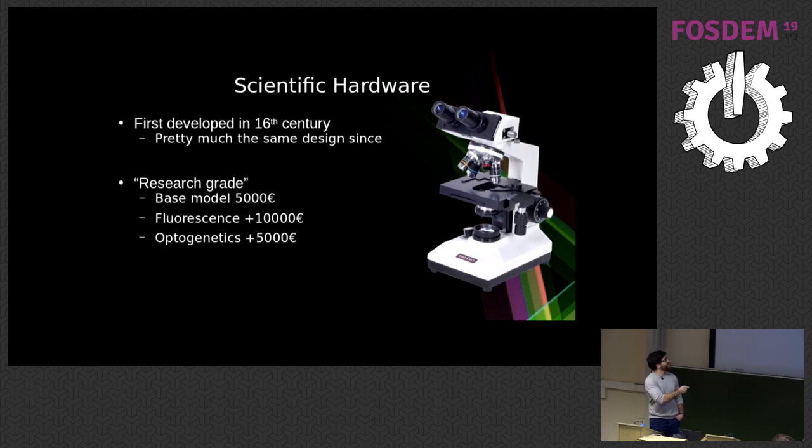If you want to add functionality to it, you need to add quite heavily a lot of money pretty fast. And there is no scale here, but these devices are about yay big and they weigh at least 5 kilos. So they're really hard to transport everywhere. And they're plugged to mains all the time, which means that for some parts of the world, combining all of these makes them really hard to get, right?